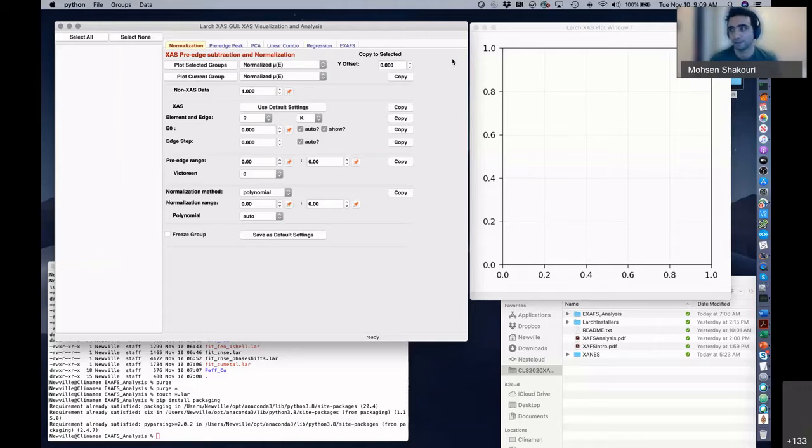That's an excellent question. So one interpretation of this is that the photoelectron has to transition to an unoccupied level. There's no real requirement for that to be a level in the continuum as opposed to an atomic level.